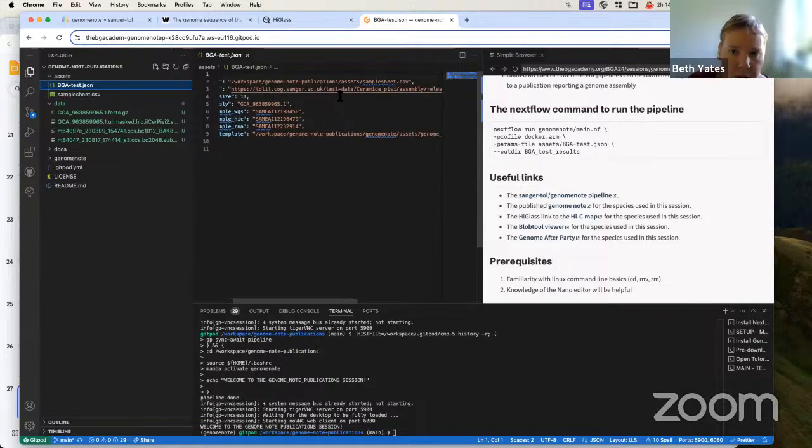It's basically telling you where the sample sheet is, where the FASTA sequence is. We're giving it a path to our S3 bucket, but you could have the file locally. So like here in data, we could just give a path to that. We set the k-mer size to 11. That's just for the purpose of running this pipeline at a speed that's manageable.